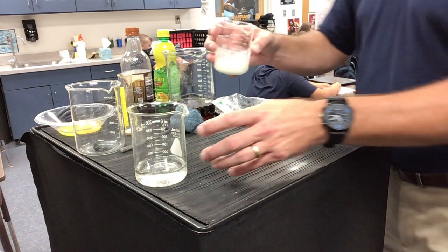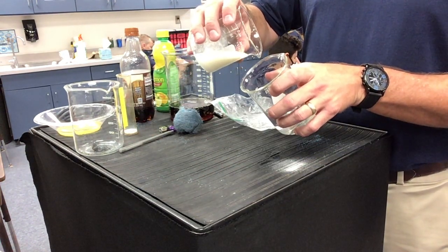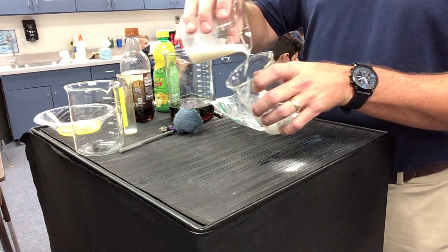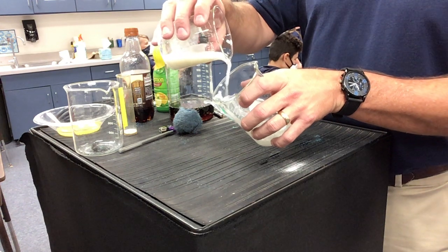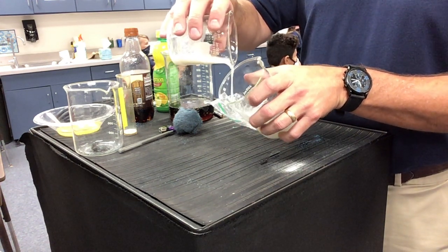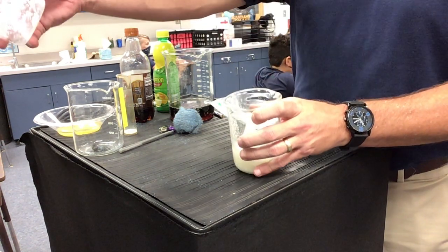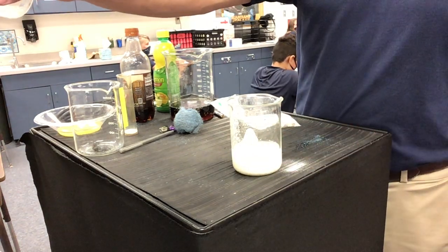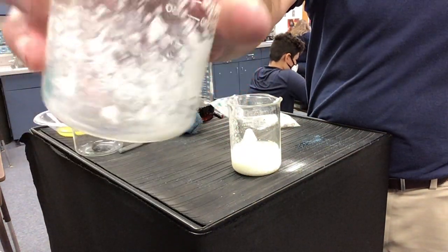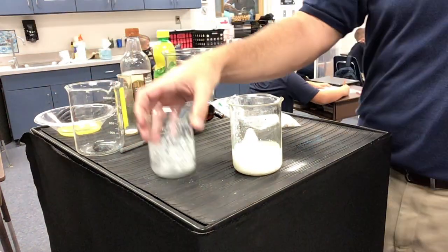In fact, if you want to watch, you might be able to see. There we go. Is that the milk? That's the milk and vinegar. And you can kind of see what has happened, especially on the outside of the glass. Okay.